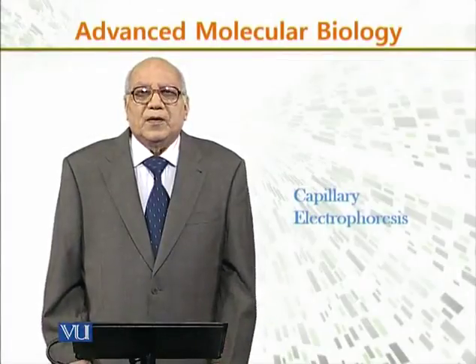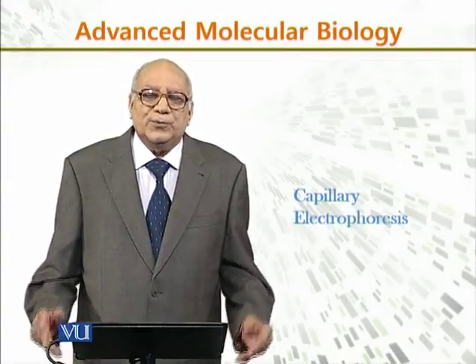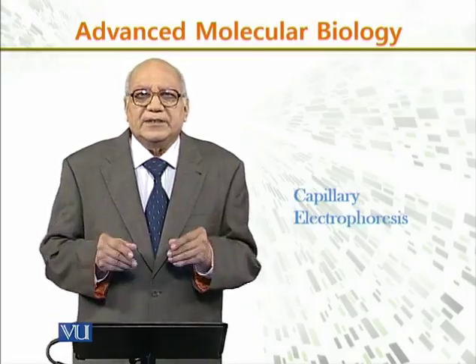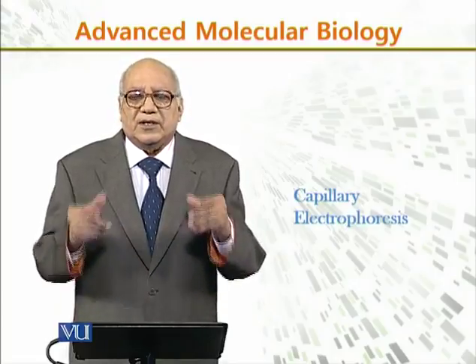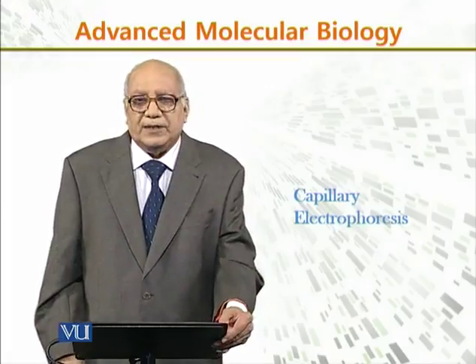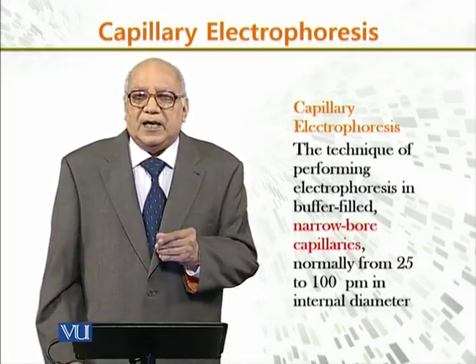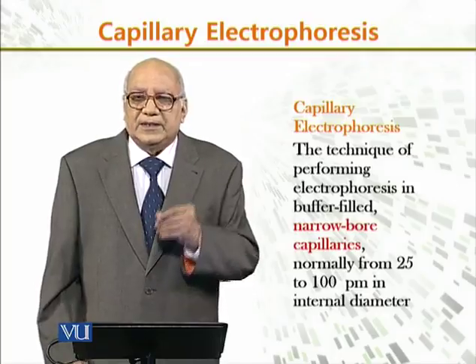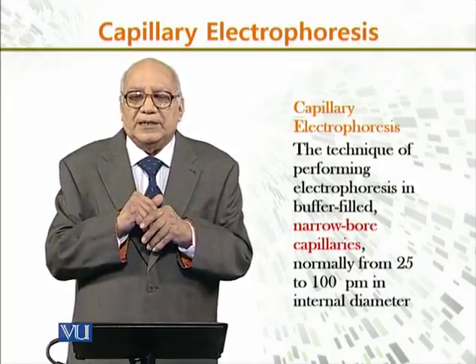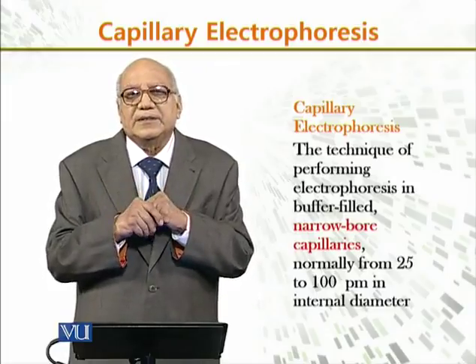In this module, we will discuss another very interesting and useful technique for the estimation and for differentiating the different DNA molecules or RNA molecules, and this is known as capillary electrophoresis, abbreviated as CE. Now, this technique of performing electrophoresis is done in buffer-filled narrow-bore capillaries, which are normally from 25 to 100 µm in internal diameter.